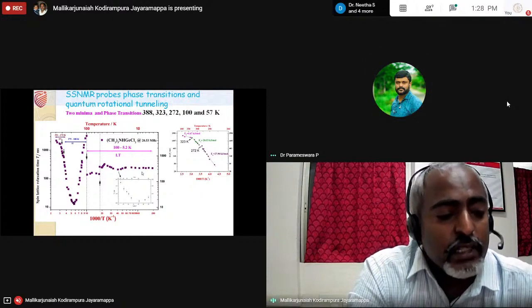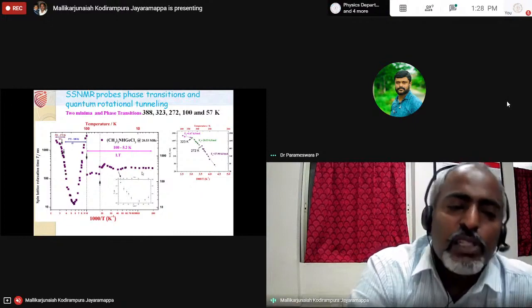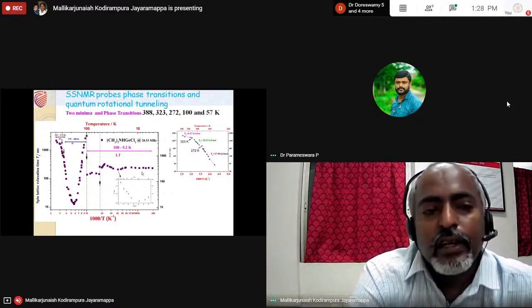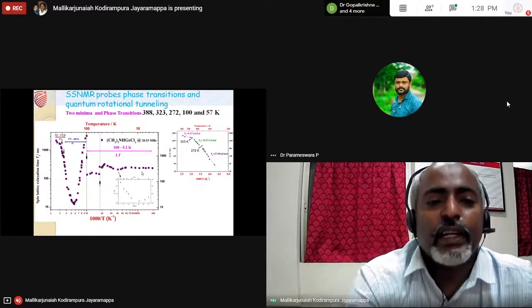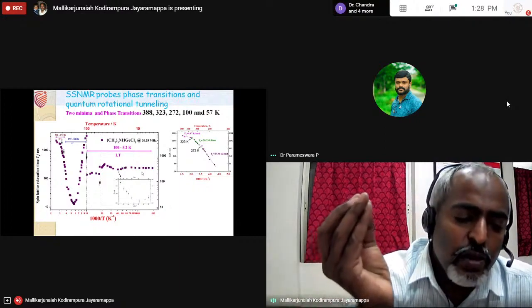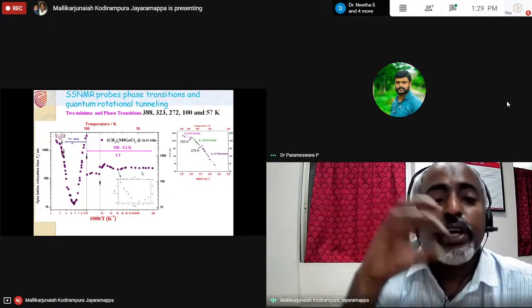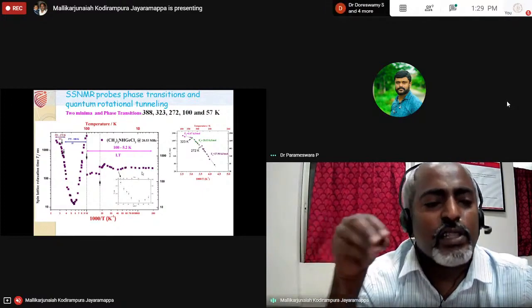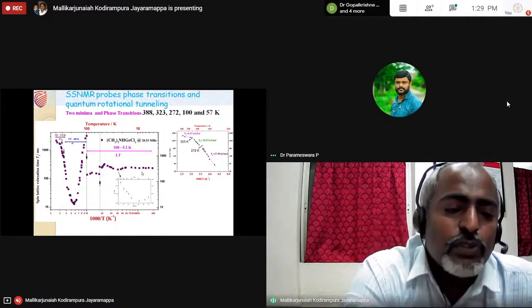Experimentally we are performing the experiment. We perform these zero field NMR experiments. Most of our papers, 2-3 papers, are on that iron NMR. If he is asking why I am not seeing it outside, the answer will be different. But we have many papers on this iron which gives 33 Tesla. Why we are not seeing it outside is another question. Because whatever 33 Tesla I am talking about, that is happening at the site of the nucleus, not outside.